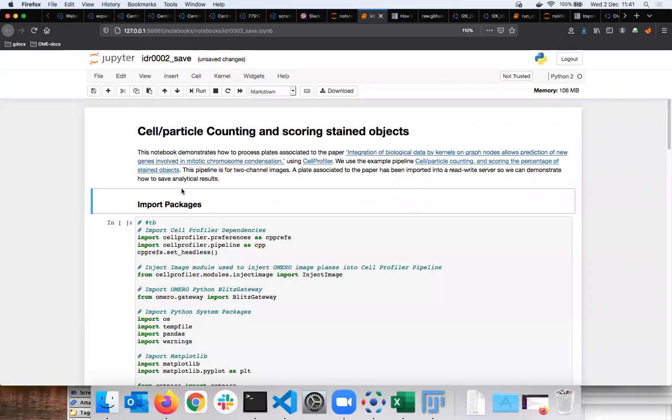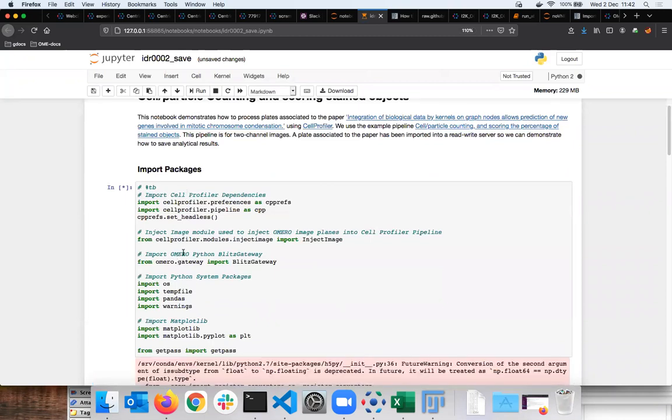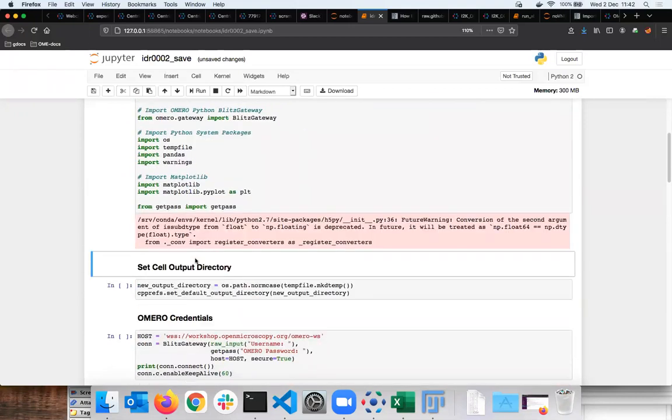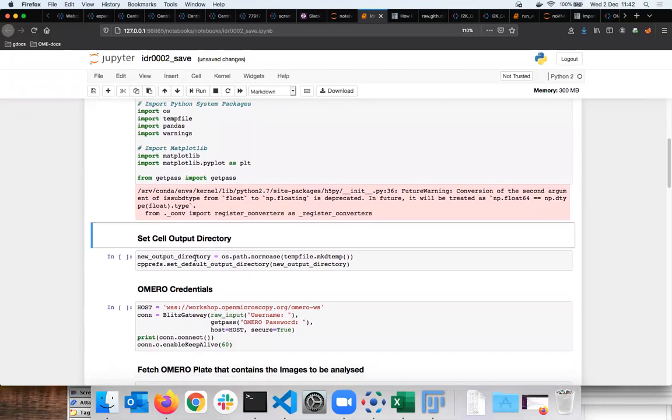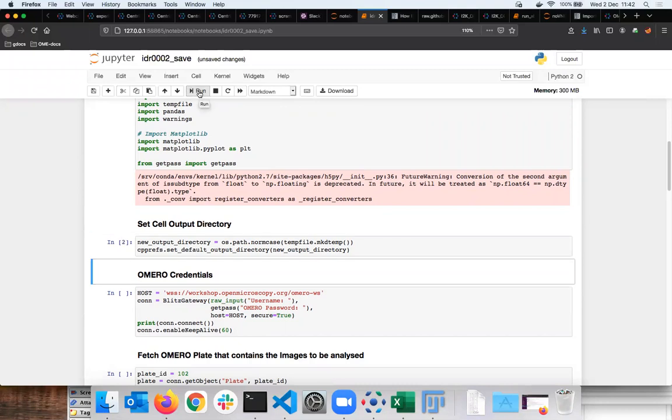In that case, you need to be clear that we're using the CellProfiler API. We're not using the CellProfiler client that you might use only through the user interface. Here we are using it headless again, because that's the most natural way to interact OMERO with a tool like CellProfiler. What you will typically do is build a pipeline on a couple of images, and when you have a pipeline that you're happy with, you run it on a larger scale on many images.